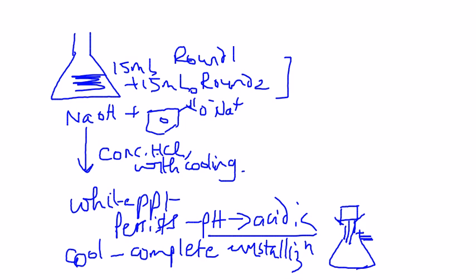That's your filtration flask, vacuum. You're going to filter through, and then dry it. We will have the oven on, so you will dry it in the oven at about 100 degrees for about 10 minutes. That will hopefully dry off all the moisture, so you should be able to get it nice and dry, and you can then do a melting point for this.